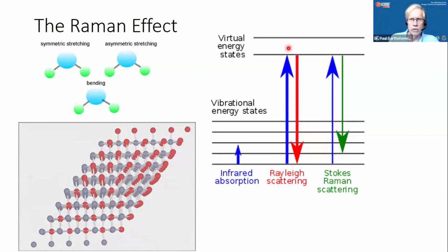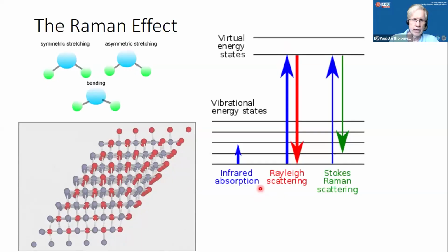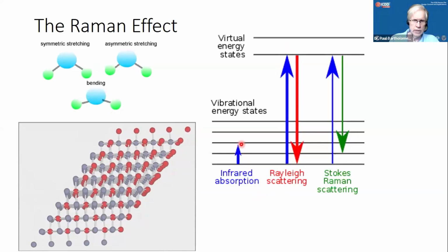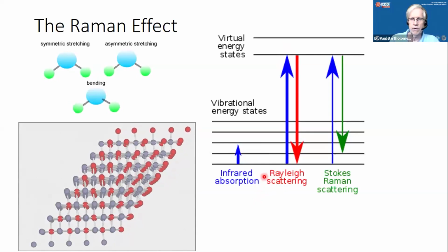The kind of things that can happen, the most common interaction is the vibrations absorb a photon, are raised to an arbitrarily high state, fall back to the ground state, and release a photon of the exact same wavelength. In some cases, when the energy of the photon matches one of the elevated energy levels, it's simply absorbed. That only really happens in the infrared, and hence infrared spectroscopy.